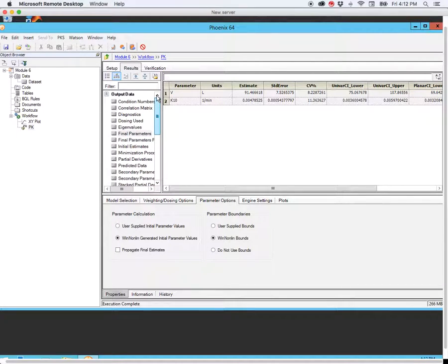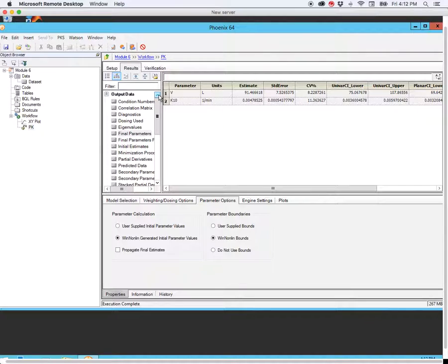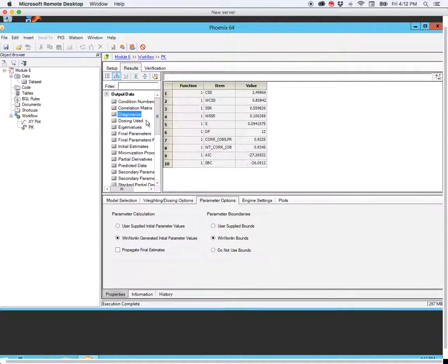We see that this returns a whole lot of different files in terms of the output data and output plots. It's beyond the scope of this course to go through each of these files in detail, but I'm going to highlight what I think are the most important ones for you to focus on, and also the most important plots. The first is the diagnostics. This gives us some information about the model fit — these are the sums of squares that were minimized by the program in fitting the model to the data.